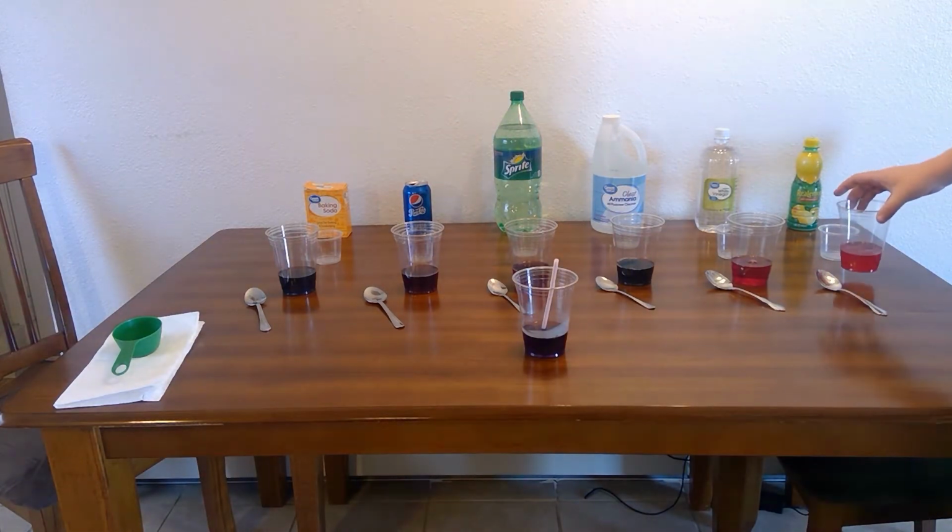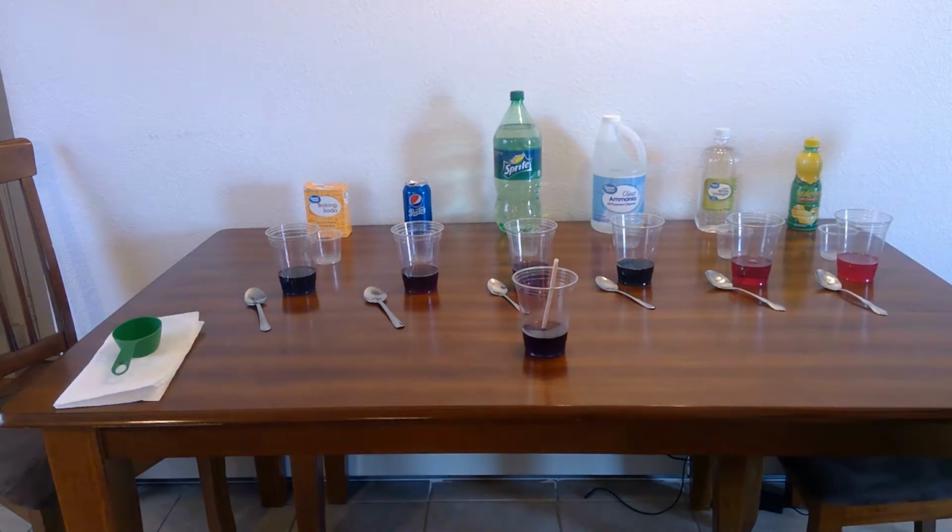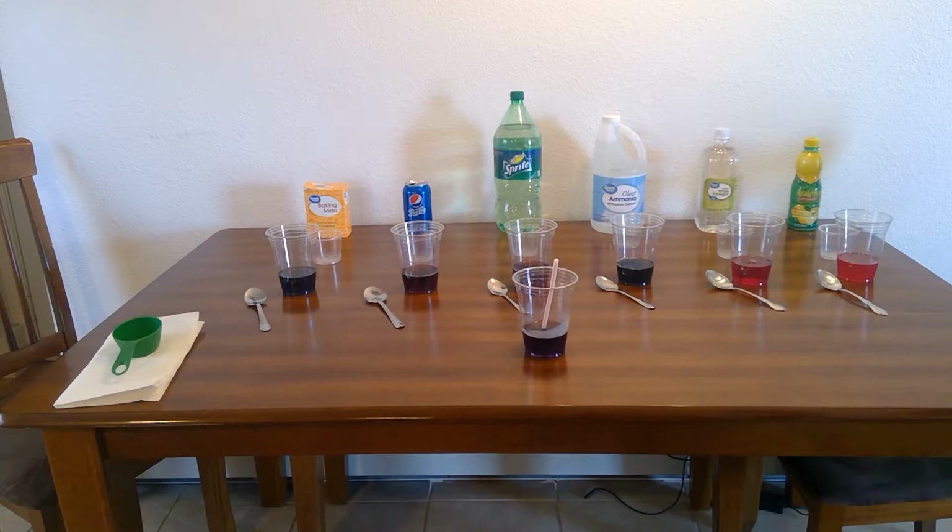So what we're seeing is lemon juice and vinegar are your most acidic things, that change the pH a lot.